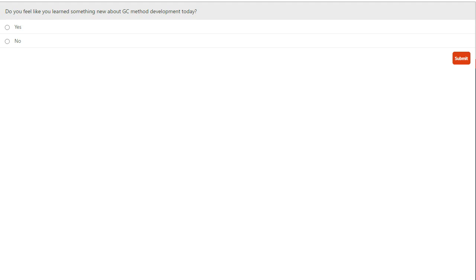So this is an interesting one, because the trivial response is, why would you want to go slower? But when we look at this in more detail, we need to consider the physical constraints that we have with the system as well. My suggestion is that in terms of methodology, if the system is optimized for fast GC, then absolutely fast GC should always be used. Where a system hasn't been optimized in terms of thermal gradients, etc., then in that scenario, standard GC. And this also relates to detector response times as well. Hopefully that answers the question.